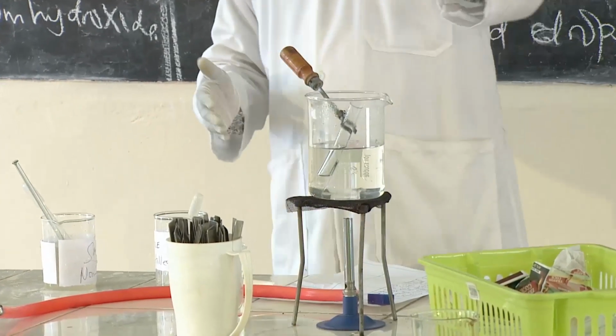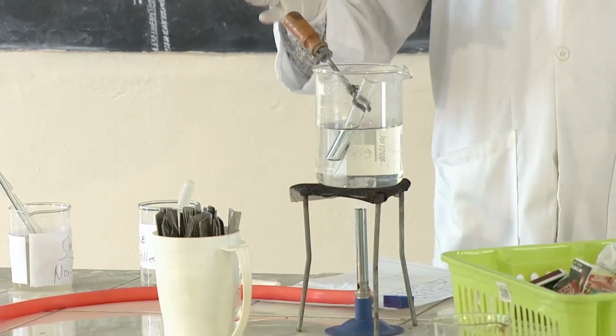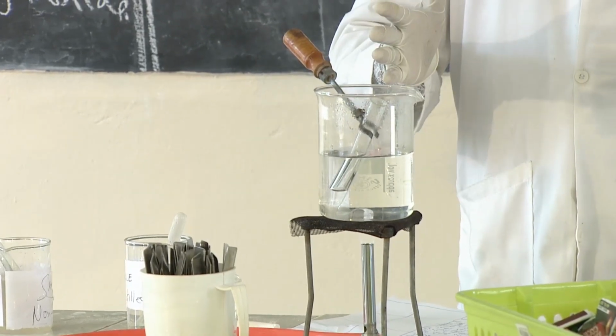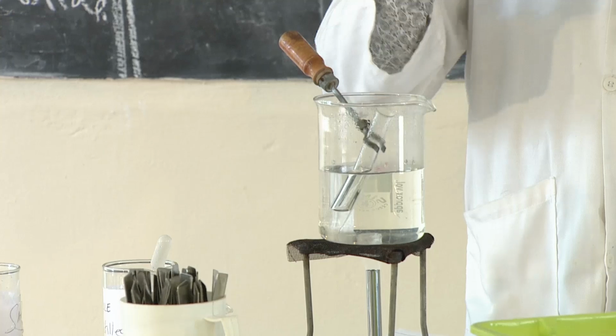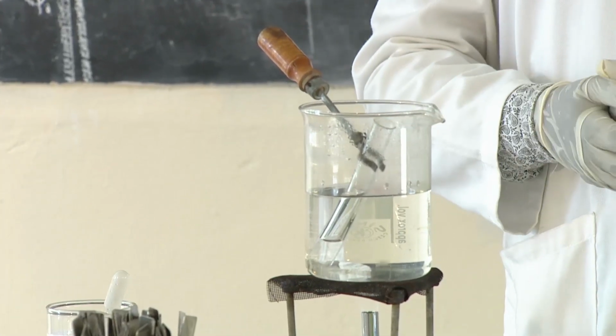Here, we are in a kitchen. We are trying to see, not in a kitchen, we are in a laboratory. We are preparing the sucrose to test if the solution contains non-reducing sugars, as an example of sucrose.